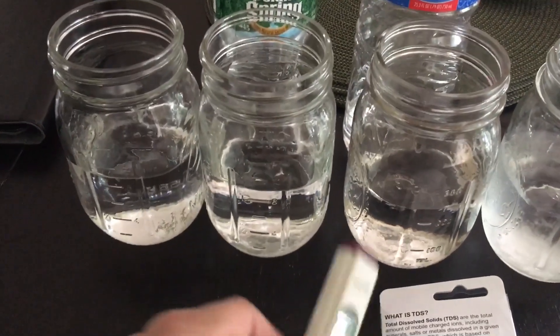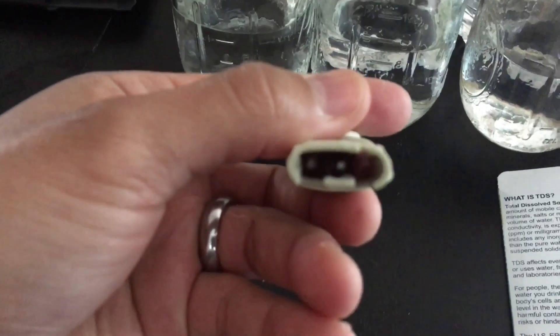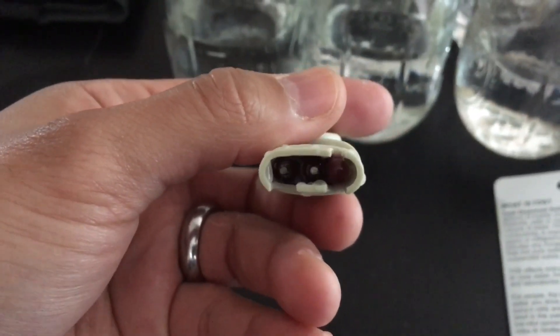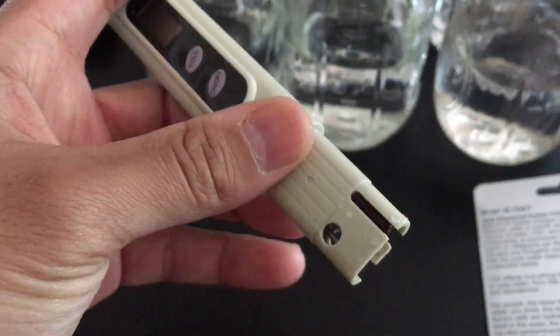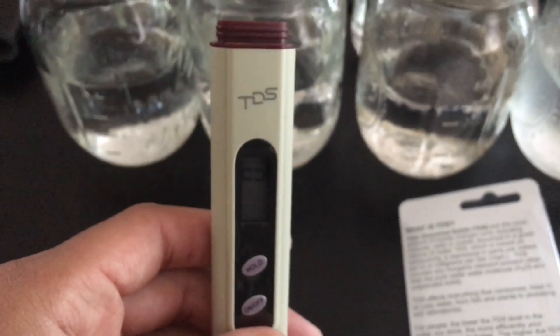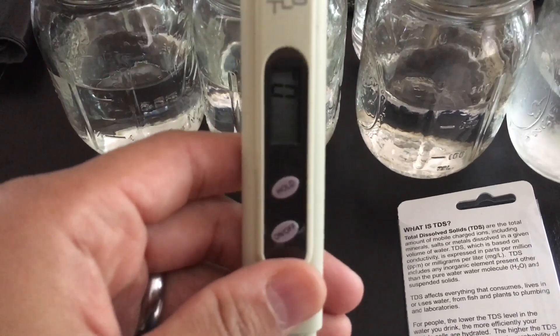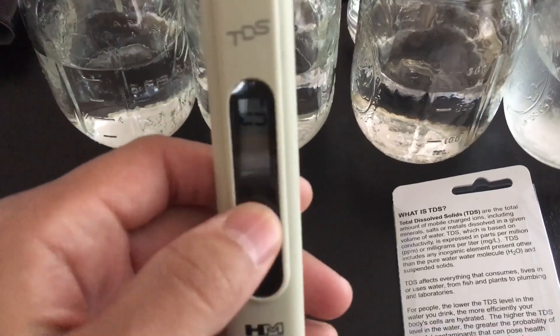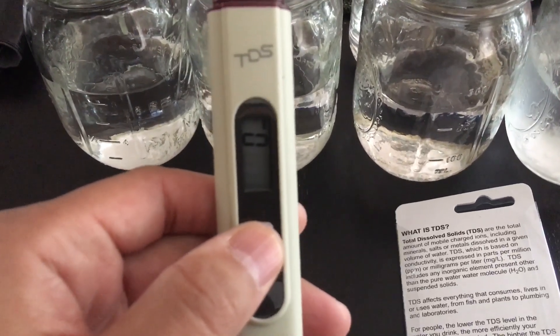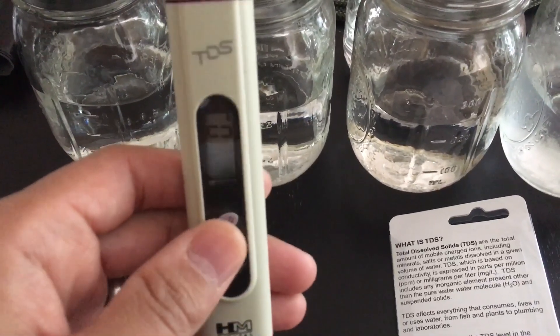The nice thing about this TDS meter is it has an on/off button and a cap, which I have removed. You can see there are a couple of sensors. The instructions recommend you do not touch those sensors, and that you always wipe down your TDS meter after use before putting the cap back on. It comes already factory calibrated, which is a wonderful feature. You have your on/off button, and when testing water you can click the hold button, which locks in the reading so you can review it and ensure your TDS parameters are in check.